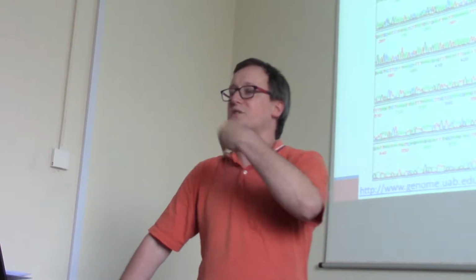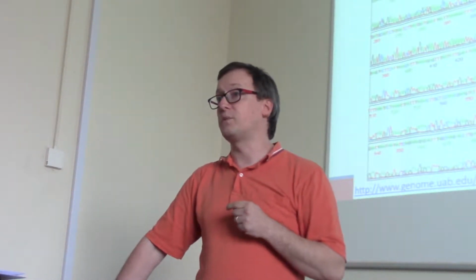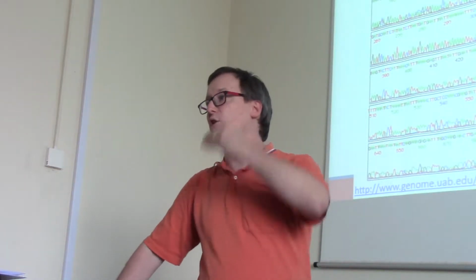Let us start with an electropherogram. I feel that it's important that everybody know what an electropherogram is because they're the essential source of data from which we derive sequences. So this problem of base calling algorithms is one of working from an electropherogram to produce raw sequence information.